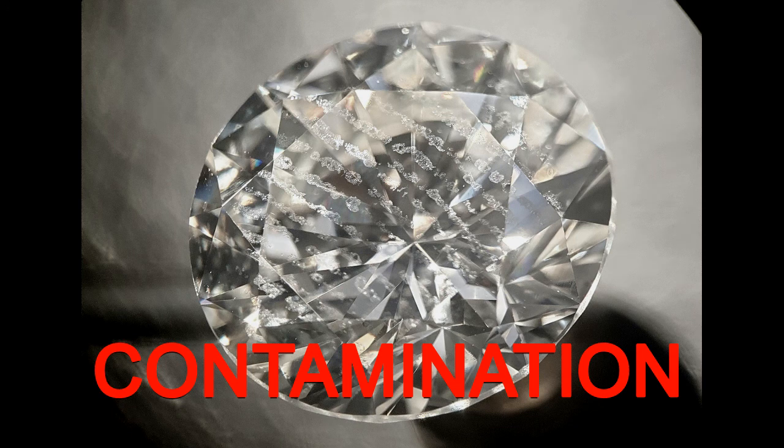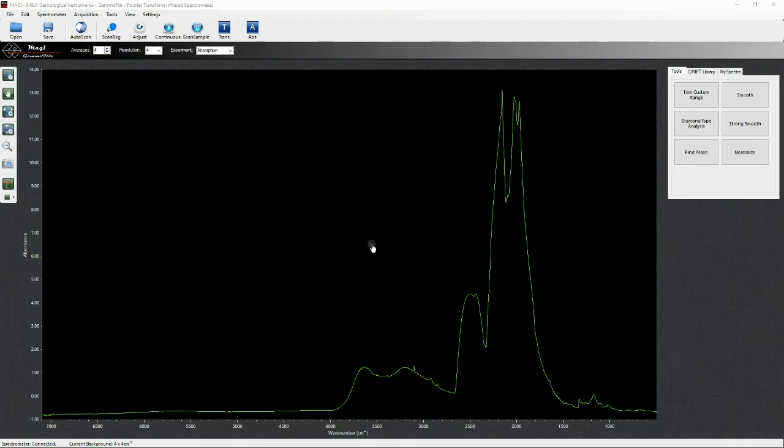Contamination. It's always advisable to clean well the stones before starting to test them. This is even more important when we are using an FTIR spectrometer. Fingerprint oil contamination, in fact, can show up in the spectrum as two peaks at 2850 and 2920 cm-1, even if only minor traces are present. If those minor peaks can be essentially ignored while testing diamonds and other stones, they can easily confuse the operator and give incorrect results when testing emeralds for impregnation treatment.